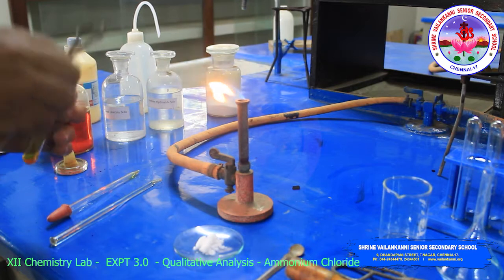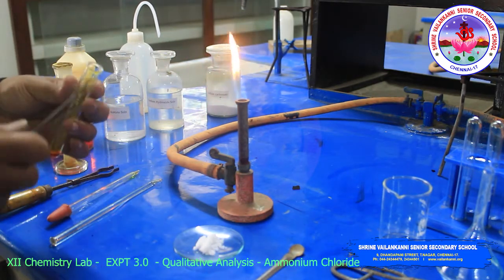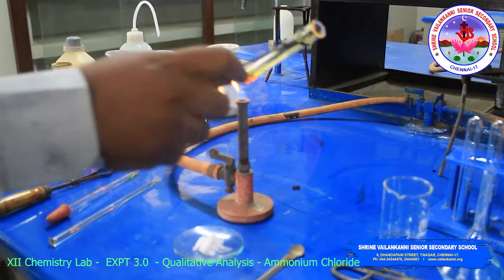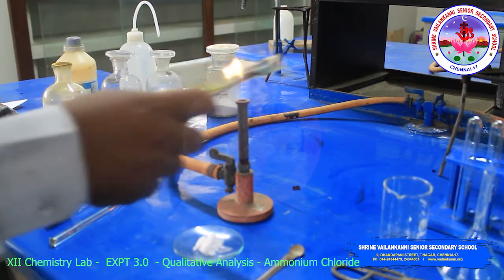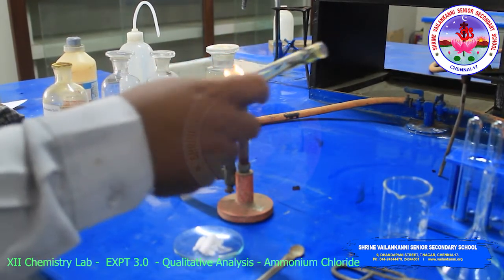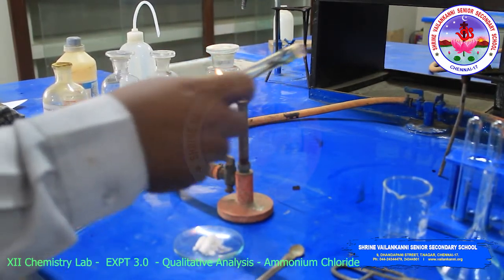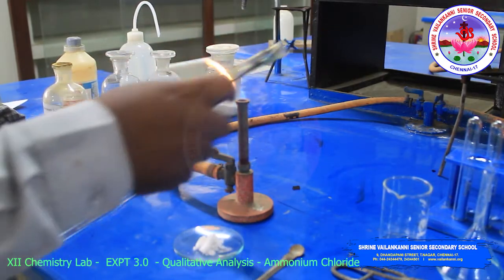When you heat the substance, heat very carefully, because of overheating. First look at the heating, you have to heat like this first, then gently heat. Do not heat strongly, because when the strong heating, the apparatus will burst.